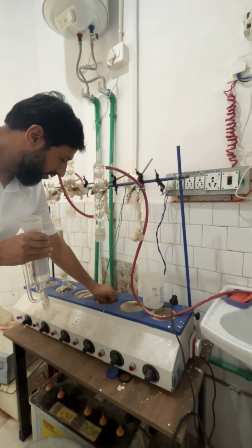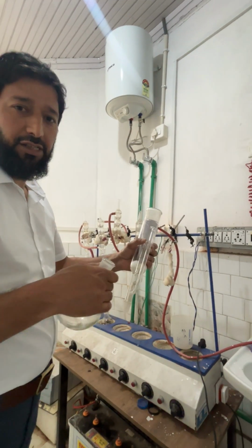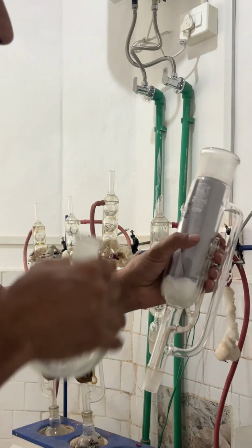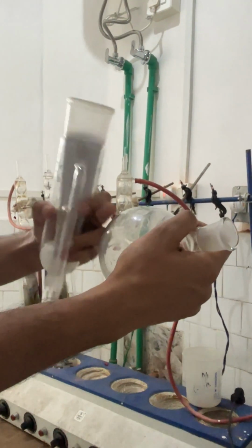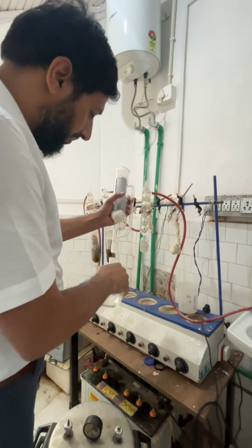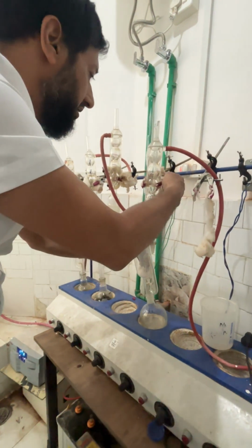We need a flask also. This is our Soxhlet room, so we have an exhaust here. So this is your flask. It's a 500 ml flask. So always see the unitage. It's a 200 ml Soxhlet apparatus, and we will always take a flask more than double the size. So we put the flask like this on the Soxhlet apparatus, and then this is the condenser.